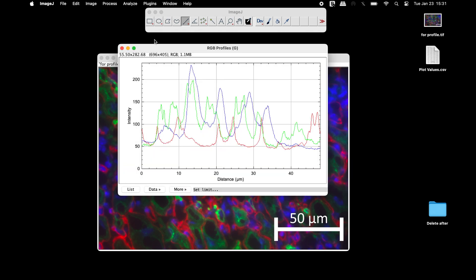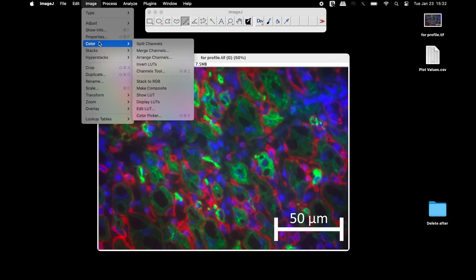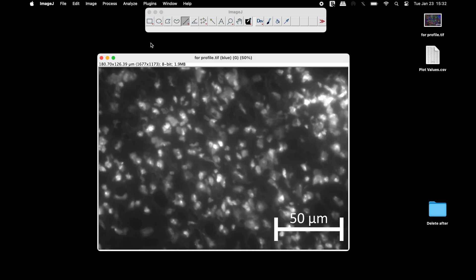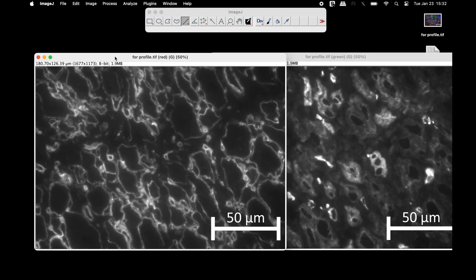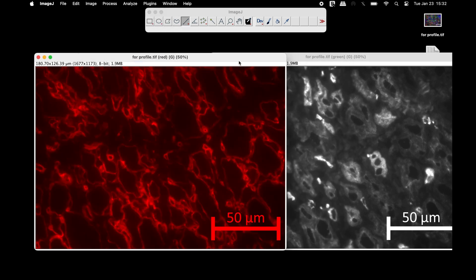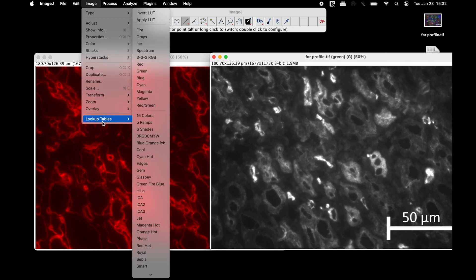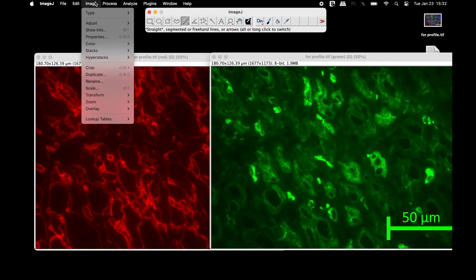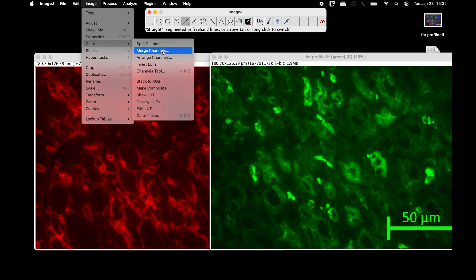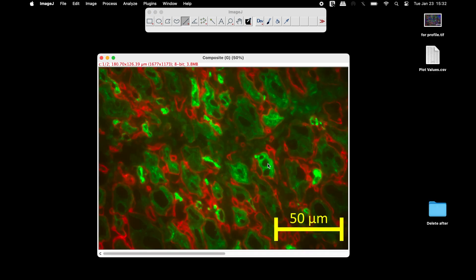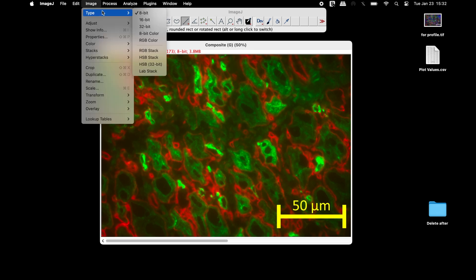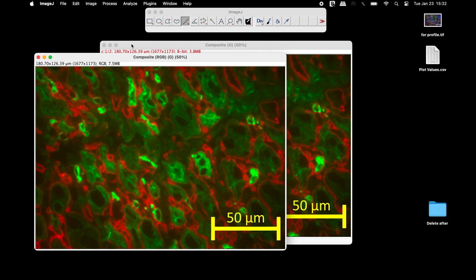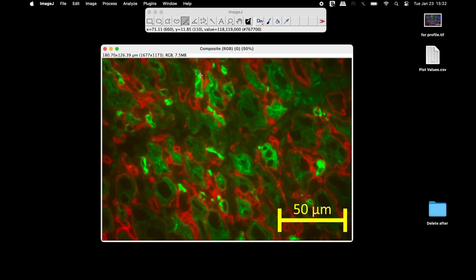To plot the intensities of only the red and the green channel, first split the channels and retain only the red and green channels. Use the lookup tables option to apply the respective colors to the image again. Next, merge both images and convert the 8-bit image into an RGB color image.